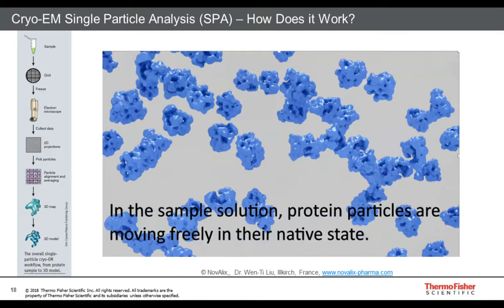The first challenge is to get the best sample quality. After that, it's important to minimize the time on sample preparation and sample optimization, because you want to go as fast as possible to the microscope where you do the final analysis, preferably at the resolution that is needed to answer your scientific question. And that can be anything, but in general something below 3 angstrom is sufficient to answer most scientific questions. On the first part, getting the best sample quality, there are a few crucial components that are important and should be taken into account.